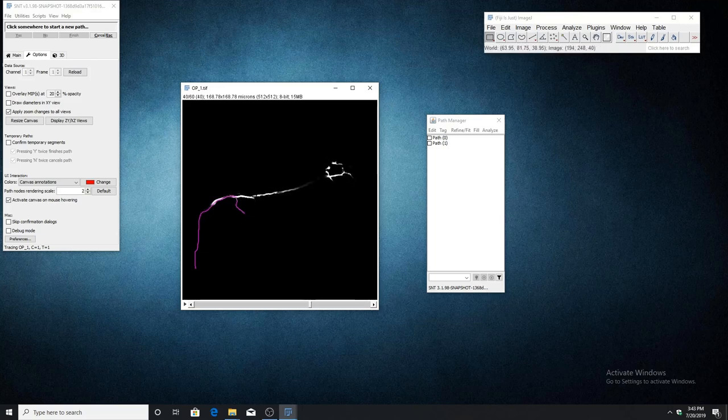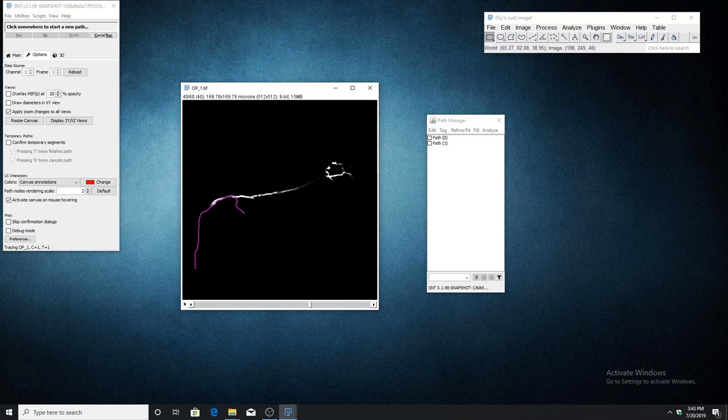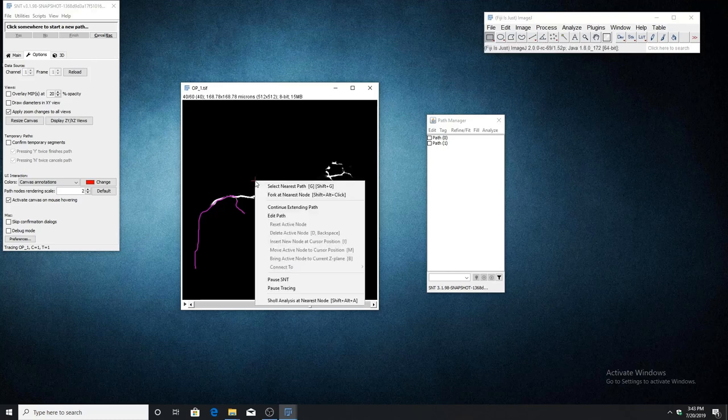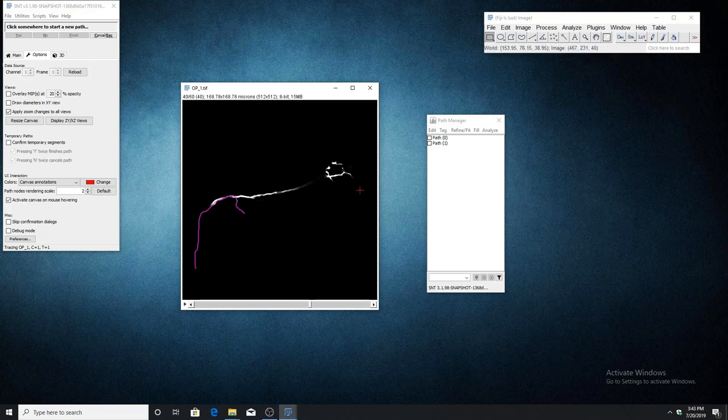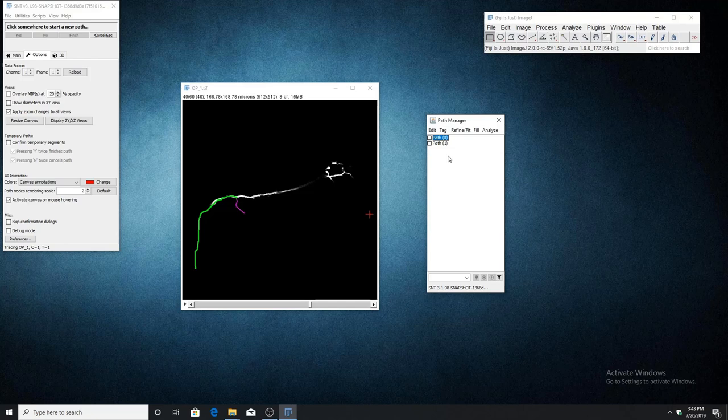We can continue tracing previously finished paths by using the continue extending path option. To do this, first select the path that you want to continue tracing, either in the path manager or by hovering your mouse over the path and pressing G on the keyboard.